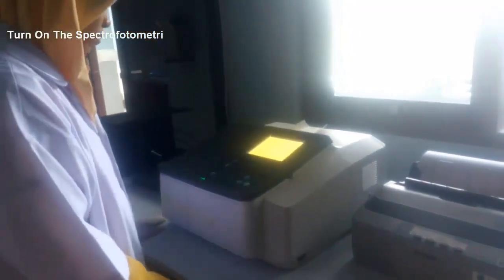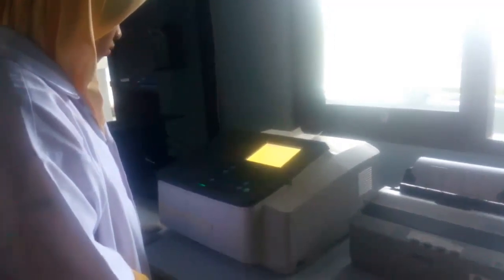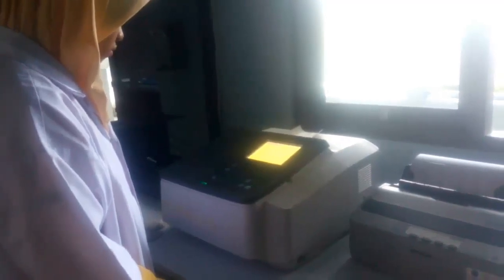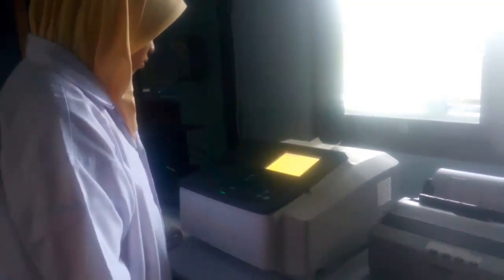To turn on, click the switch on the right side. And wait for the instrument to initialize.